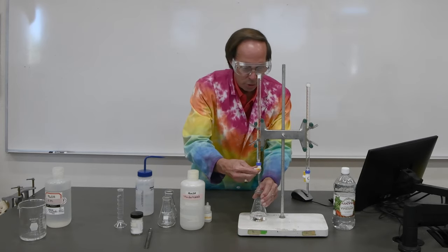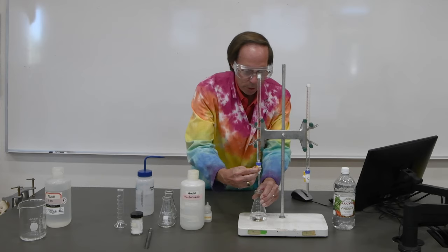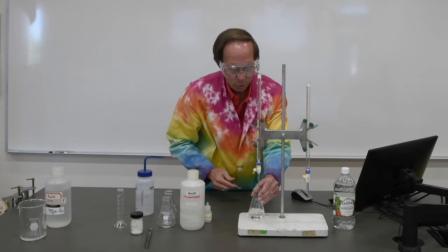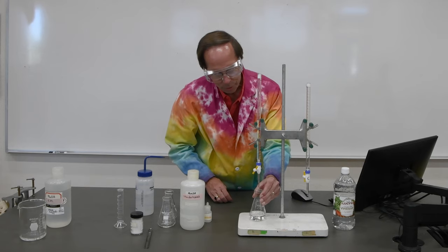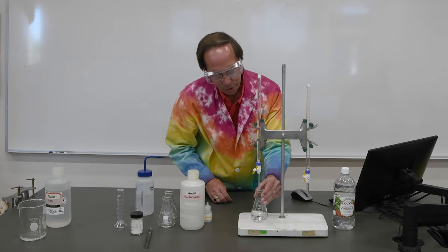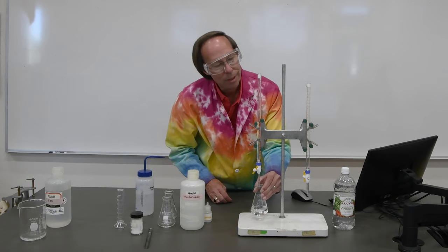So we'll go ahead and start adding this one drop at a time until we reach the end point. There we go. So one drop at a time. We'll swirl after each drop. And once the pink stays with us for 30 seconds, we'll know we've reached the end point. You might be able to see the little bits of pink when the drop first hits, and then it disappears as it reacts with the acid. But we should be getting pretty close here.